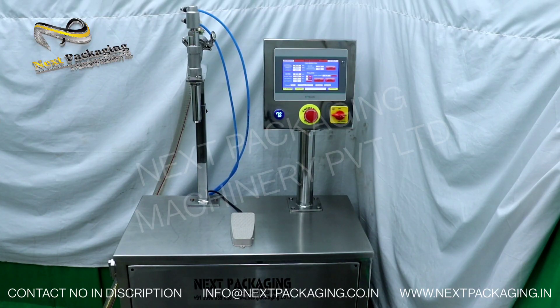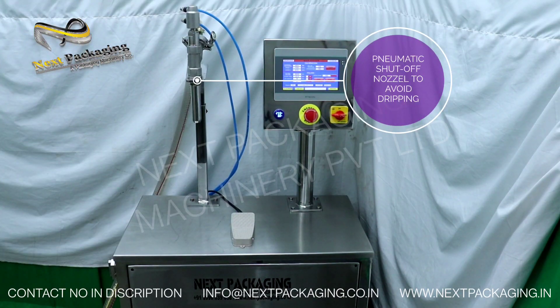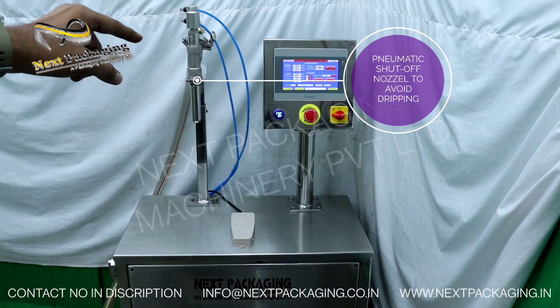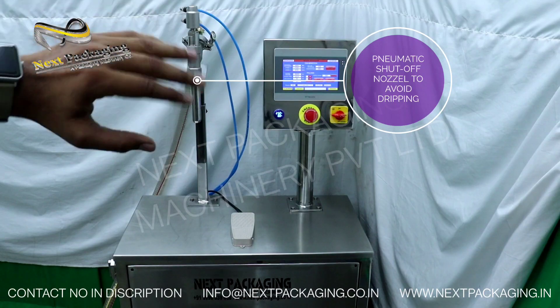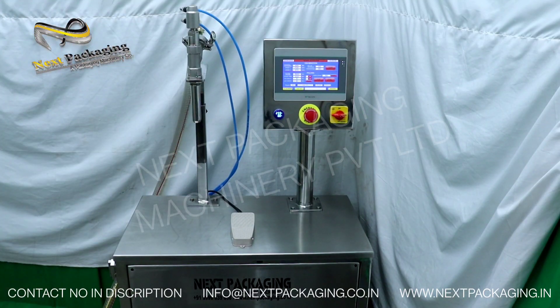This is one of the easiest machines to operate — settings can be done very easily and you can start the machine quickly. In this model, the nozzle is a pneumatic shutoff nozzle which requires an air compressor. Once filling is done, the nozzle will be completely shut so there will be no dripping.